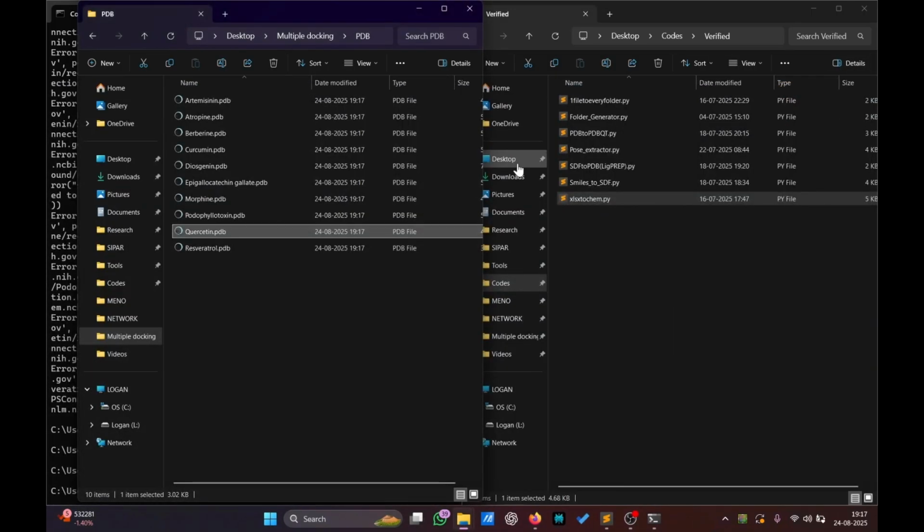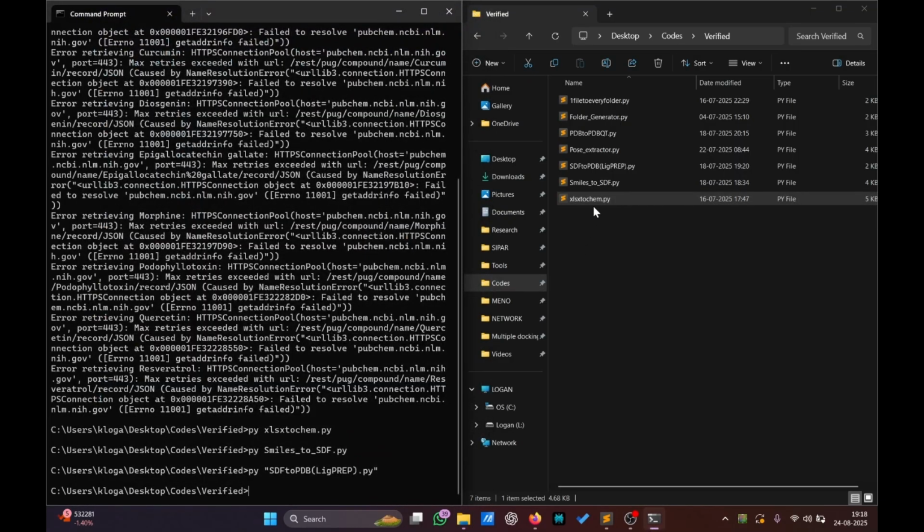Close this. If you are comfortable with PDB, you can go for PDB. But for PyRx, according to me, if you convert into PDBQT, you don't have to select the ligands individually. I will show you while I am explaining the docking procedures. Let's stick to this procedure right now.